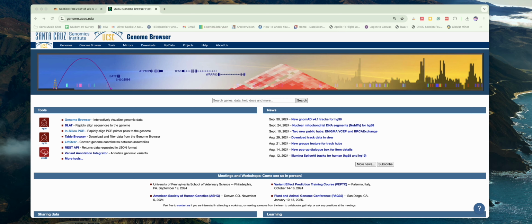Okay, Dr. Mitton here. I'm going to give you a quick screen recorded movie of how to use the University of Santa Cruz genome browser. The first thing you'll want to do is go to genome.ucsc.edu. When you land there, it should look like this.